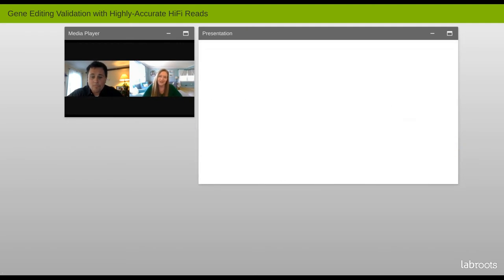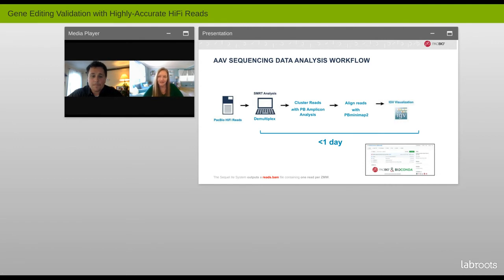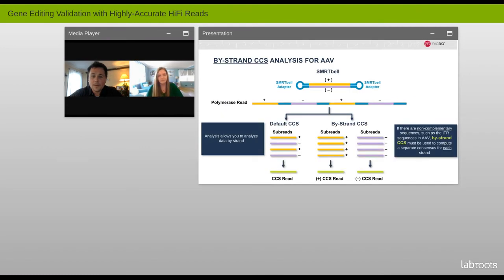Fantastic. Yeah, and so one question that I get a lot is if you're able to tell any information about what strand. Again, we were talking about these single-stranded DNAs. Is there any way that you can detect strand-specific information using PacBio approaches in the analysis or just in general? And so I have a couple slides on that to talk about it.